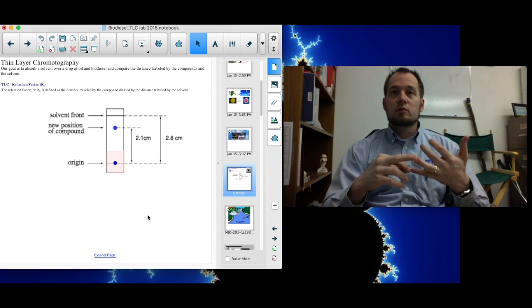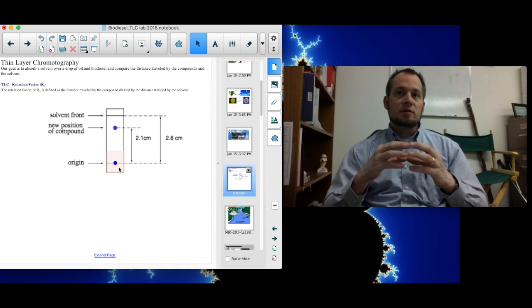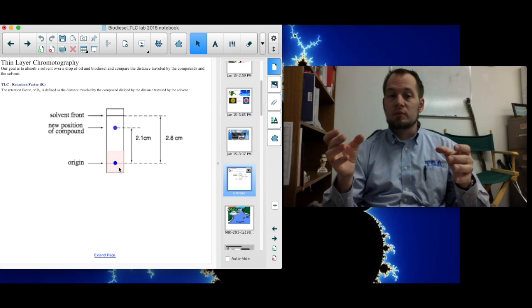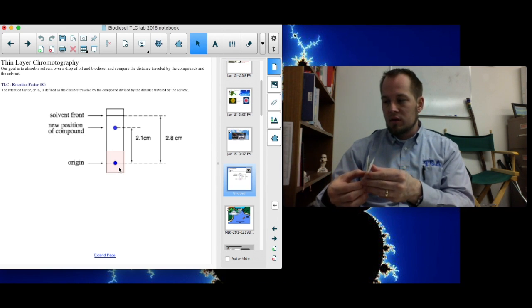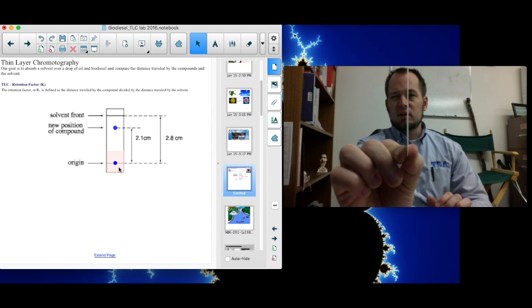So the way that it works is you would put a spot of the thing you're trying to test right there at the bottom, the little blue spot, and it sits on this plate. This is the thin layer. This is where it comes from. It's very thin. I've got one right here. They look about like this. They are very, very thin. Not a lot to them.